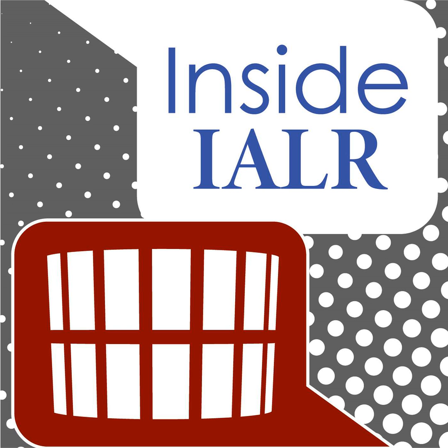Well, first of all, I can tell you that most all companies that come through the center and are interested in contracting us for plant science research are interested in those tables because it's such a unique platform. Not only does it provide you specific data all through the growing process, it also gives you lots of great images to use in marketing and in sales.